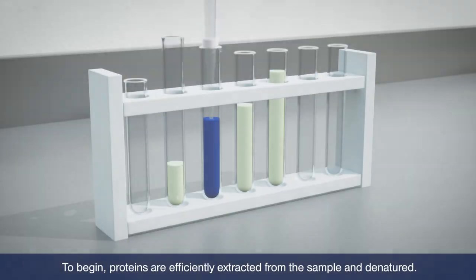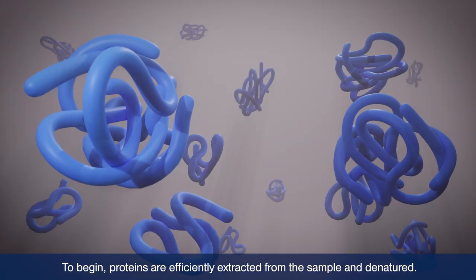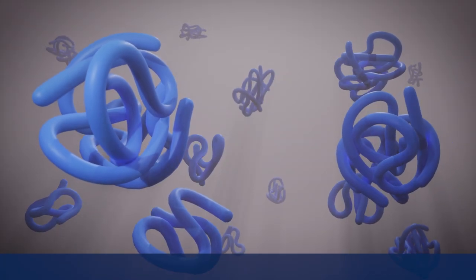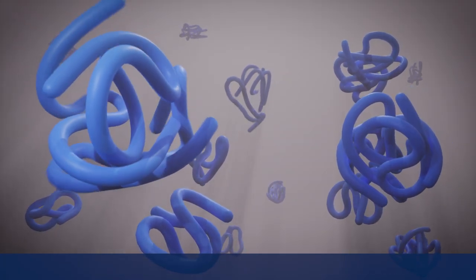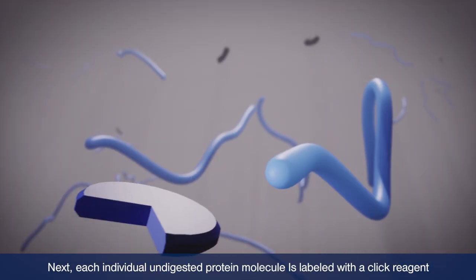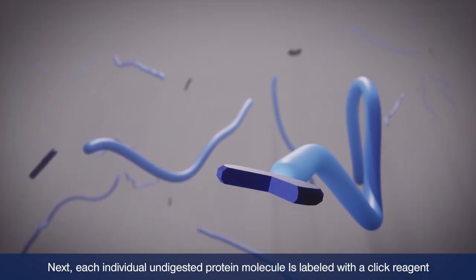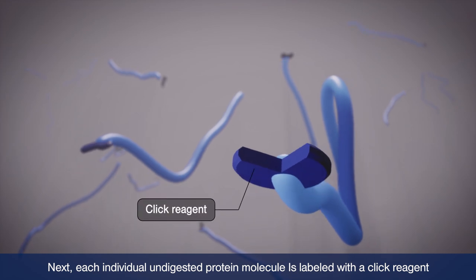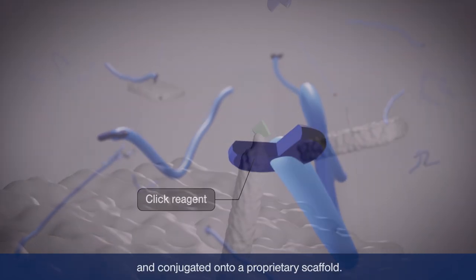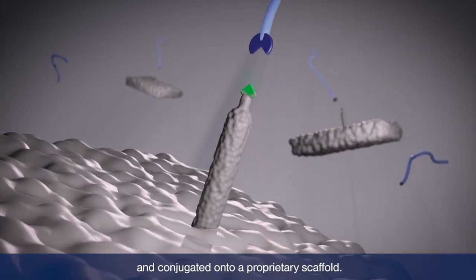To begin, proteins are efficiently extracted from the sample and denatured. Next, each individual undigested protein molecule is labeled with a click reagent and conjugated onto a proprietary scaffold.